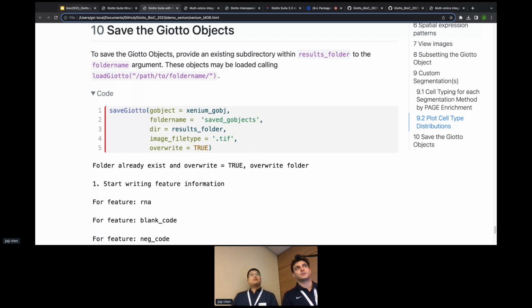That was a little bit of a long one. I think the summary of the question was, is there reasoning, and please correct me if I'm misstating, for using Terra over something like SF to represent spatial data or transcript data, I believe you said in particular?